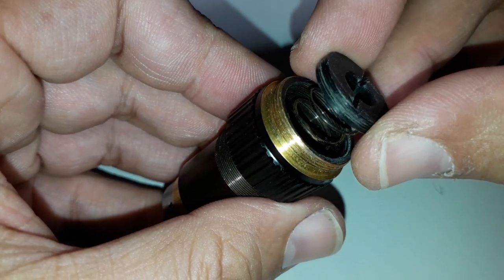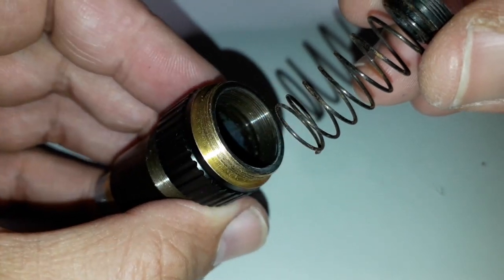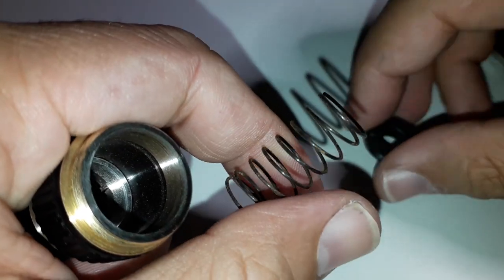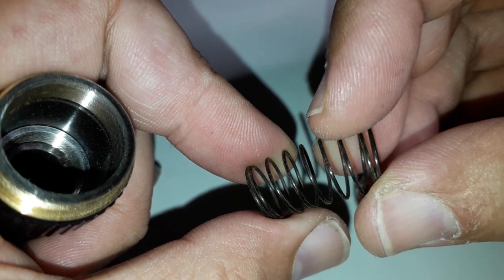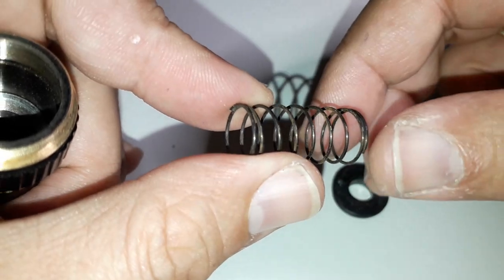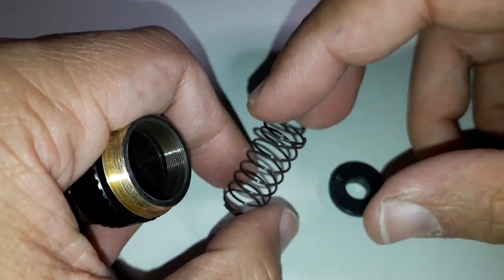I removed the next part and here I saw the spring. The first thing that surprised me a little bit is that the spring was slightly corroded. I was actually able to wipe off the rust a little bit with my finger, which kind of surprised me. That is essentially the spring that is responsible for pushing the front part down.